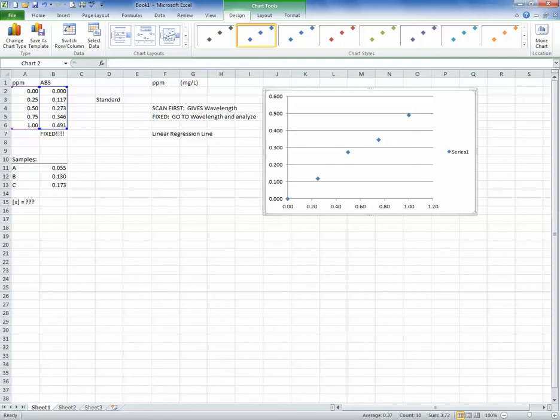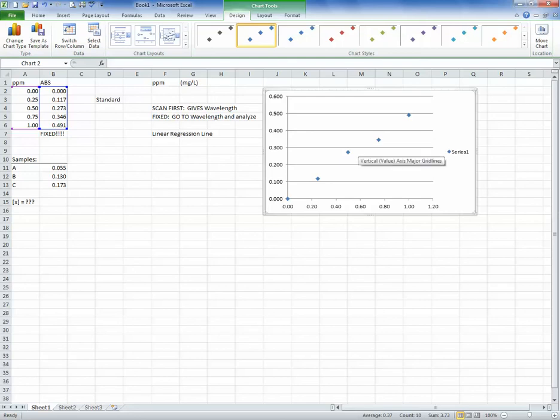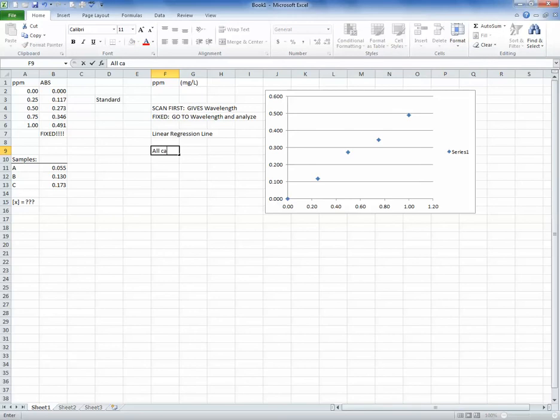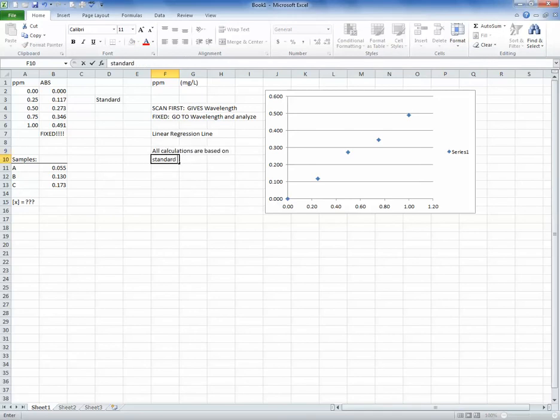So if you've plotted these sets of points, and you've made these standards, and you've plotted the absorbances, and you go to this scatter plot function, and yours does not look like they line up in a straight line, you have seriously messed something up. You need to go back and figure out what you have done, and fix that problem, and maybe rerun those samples or that one sample to get a better regression line. That's what we're after.